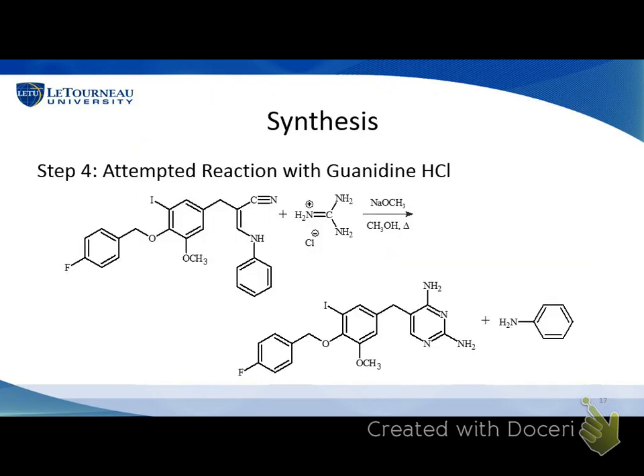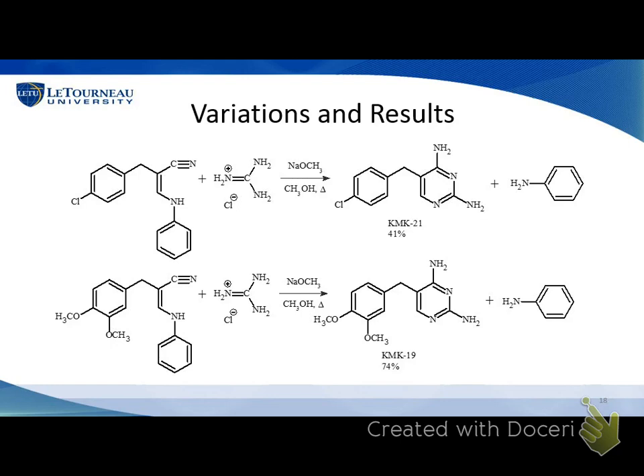We went on to step four and reacted what we hoped was our product with guanidine hydrochloride to make our final pyrimidine product. That reaction again yielded the same gooey solid that seemed to be starting material, which was a little upsetting. We knew steps one and two worked and were having problems with step three. We did try step four on some other starting compounds to see if we could get it to work — using two different benzyl nitriles reacted with guanidine hydrochloride under the same conditions, we were able to get a 41% yield of one compound and a 74% yield of another. So we knew steps one, two, and four worked.